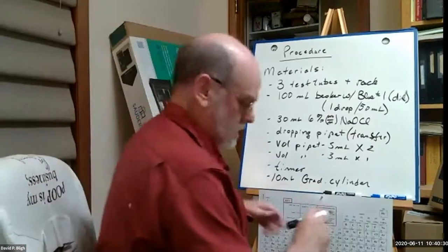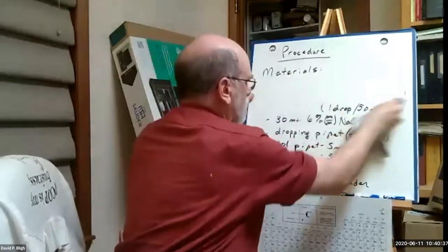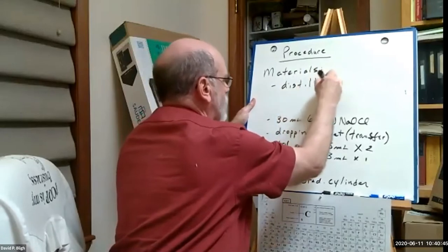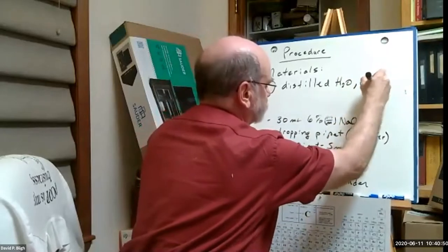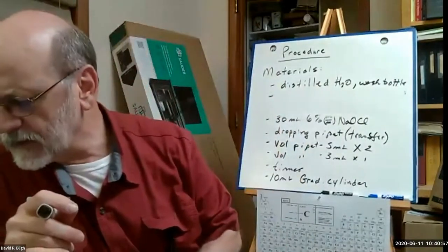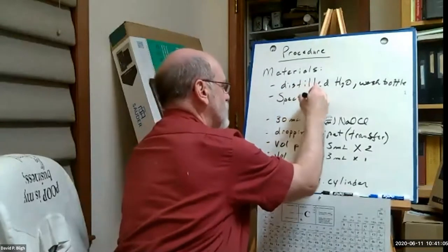Of course you need distilled water in a wash bottle. Okay. And one more thing. Oh, the most important thing. Spectrophotometer.